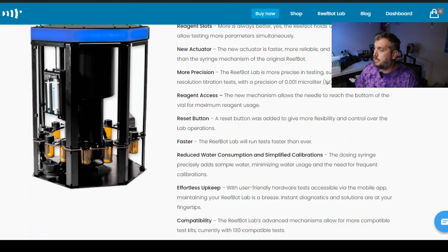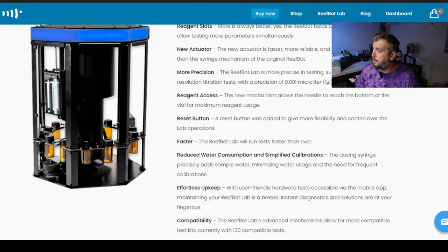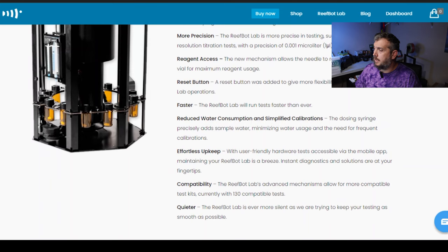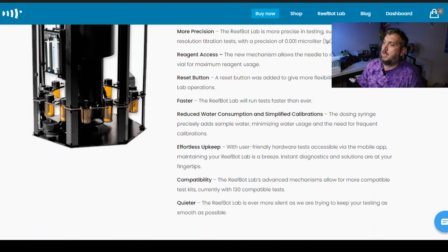The way you access the reagent allows the needle to reach the bottom of the vial for maximum reagent usage. So that's great. You can get more tests out of one test kit than you could before. A reset button gives more flexibility and control over the lab operations. I already mentioned that the ReefBot lab runs faster. Reduced water consumption and simplified calibrations. So the dosing syringe precisely adds sample water, minimizing water usage and the need for frequent calibrations. So that's really good. I like that. Even though the app will tell you when your device needs to be calibrated.